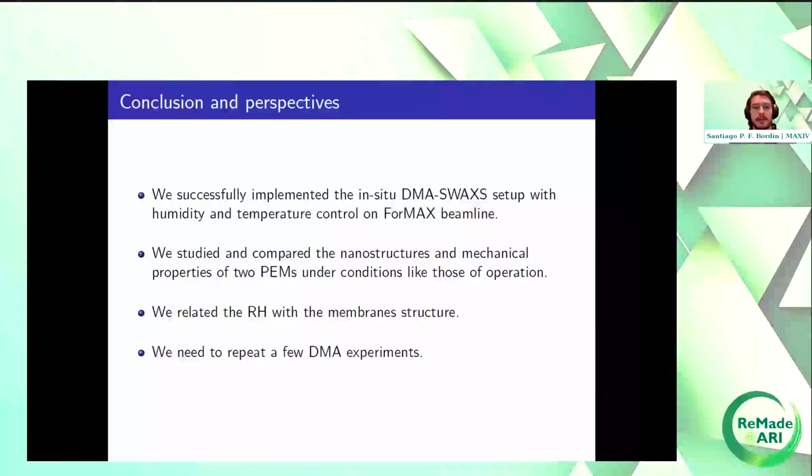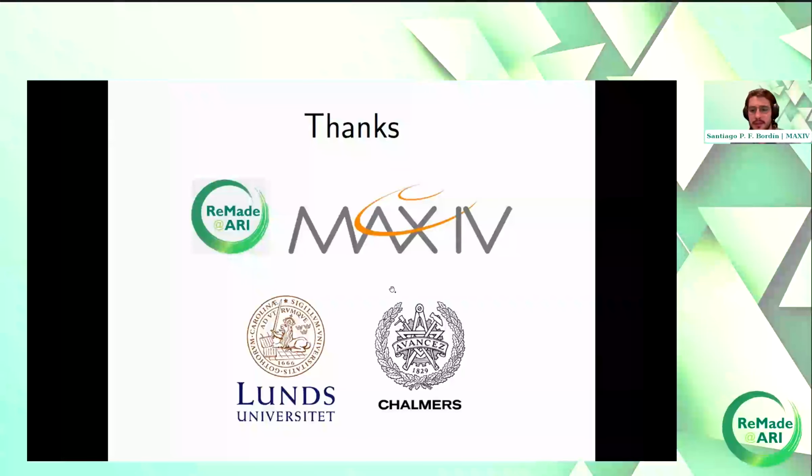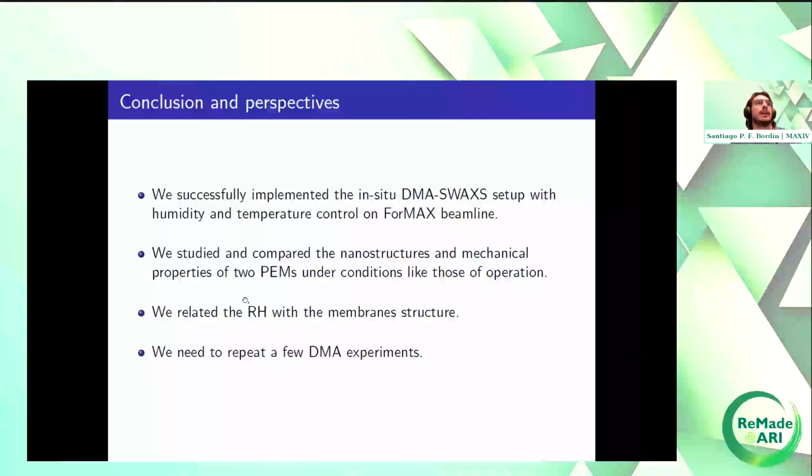It's just for remake if you are working with a circular economy, or also for a normal proposal for the MAX IV laboratory. We studied and compared the nanostructure and the mechanical properties of proton exchange membranes under conditions like those in operation. We relate the humidity with the membrane structure.